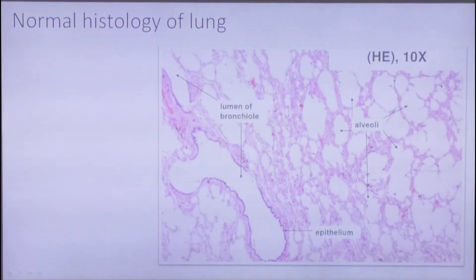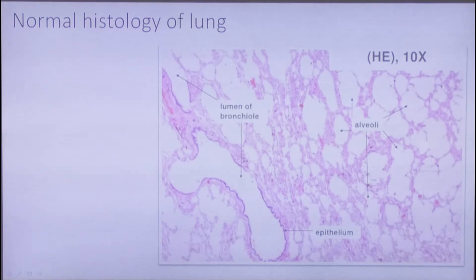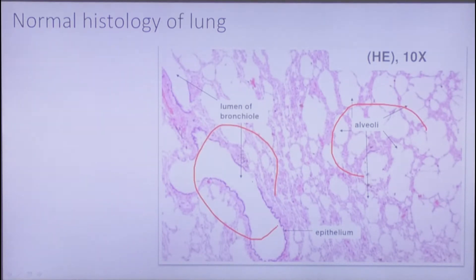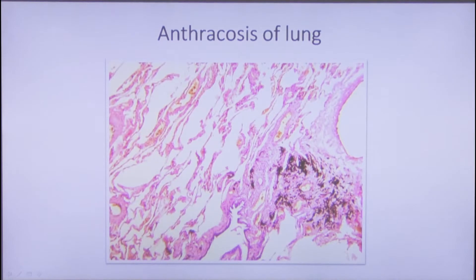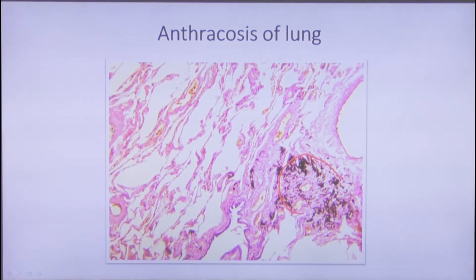First of all, we start from normal histology, because it's impossible to understand pathological processes without knowledge of normal histology. This is how a healthy lung looks like — we see here alveoli and the lumen of bronchioli. Here we see a mostly normal lung but with the presence of carbon particles. This is not necessarily a pathological condition; it happens often due to urban living.